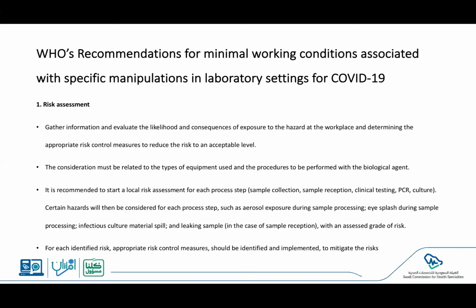So, for example, in this context, then probably we need to open the samples inside the laboratory, inside the biosafety hood, as well as use gauze that is soaked with disinfectant or alcohol or isopropanol to open the specimens, so that we can make sure the infectious agent is ineffective on the outside of the specimen.